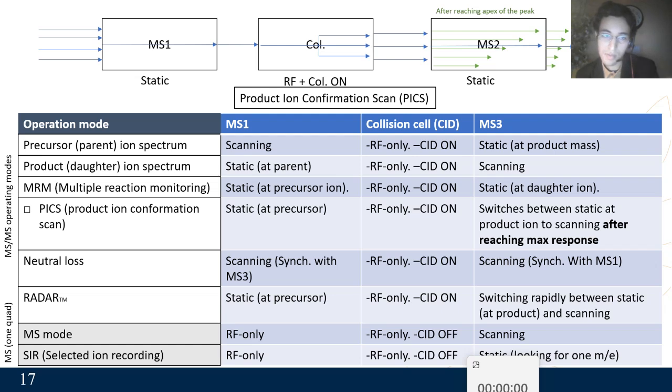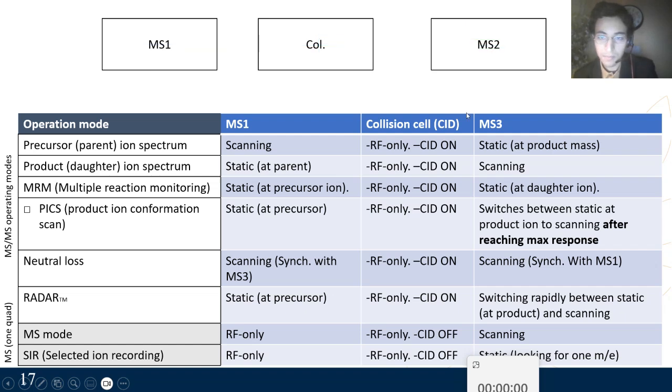This one is supposed to be a mass over charge of X, and it gives a daughter of Y mass over charge. To confirm it, here are all the possible fragment ions that come from this parent. So we look at it and see, okay, this one is the right fragment, so we are doing things right.